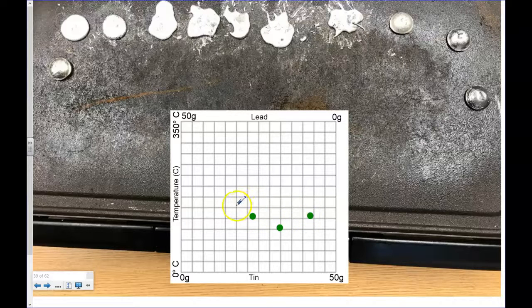Then we had spot number 6, which would be about over here, melt, and spot number 9. We have more and more heat added, and it goes back and forth, except for number 7, because 7 did something. Really, we should have 7 down here too, until we get to our higher ones. And if you notice, spot number 1 and 2 actually never even melted.